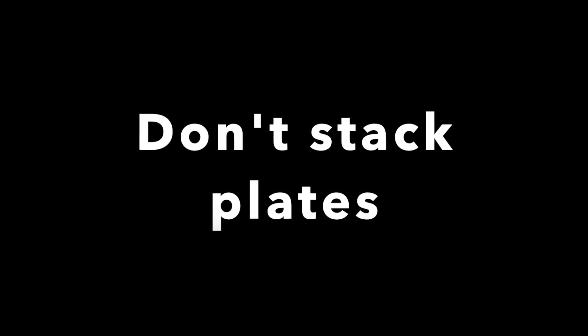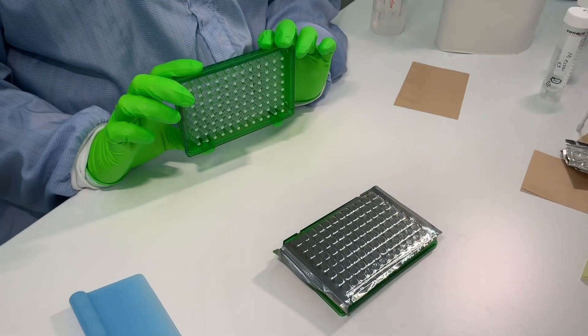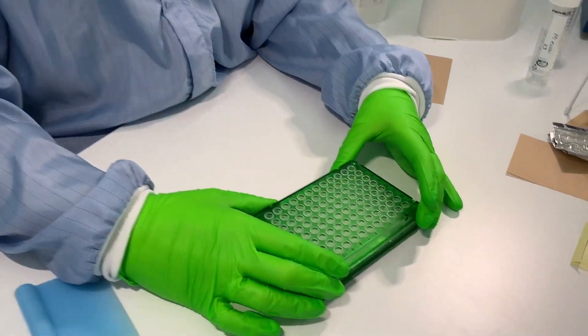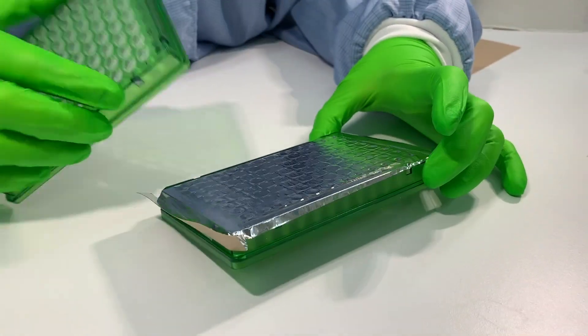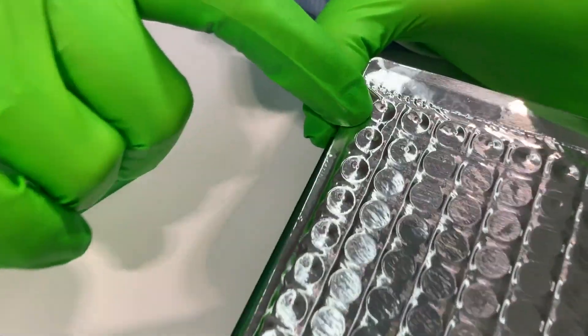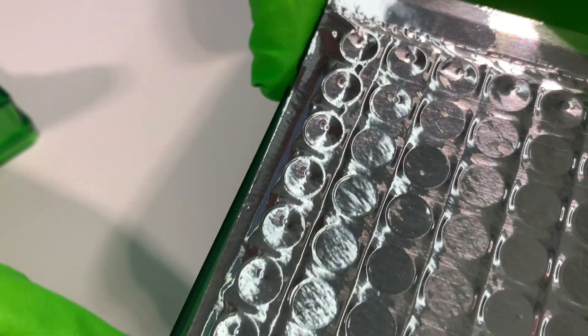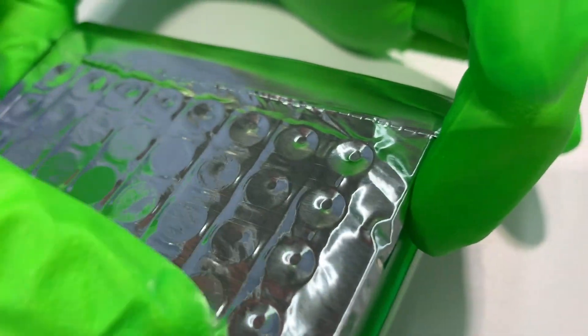The next problem can arise when more than one plate is submitted by post. The wells of our plates are designed so that unused clean plates can be stacked. Be aware that the plate seal can easily be perforated by another plate sitting on top when pressure is applied during transport. Avoid this by stacking them seal to seal or placing some cardboard between plates.